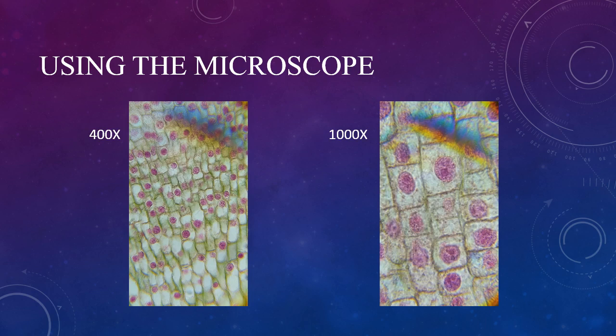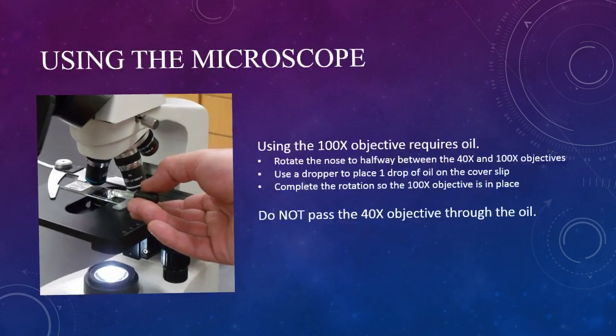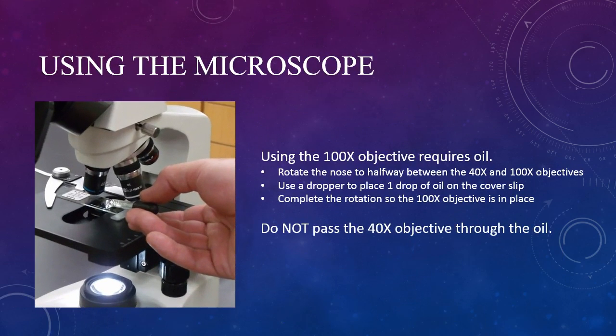We can go further, though, with another change to the setup of our microscope. There is a 100x oil immersion objective lens on this microscope. It uses oil to channel light up from the slide to the lens like a tube. Without the oil, the light would be too scattered to get a usable image at such high magnification.